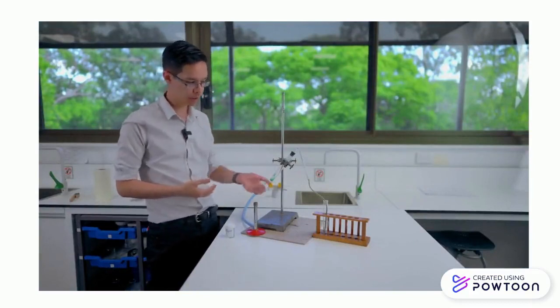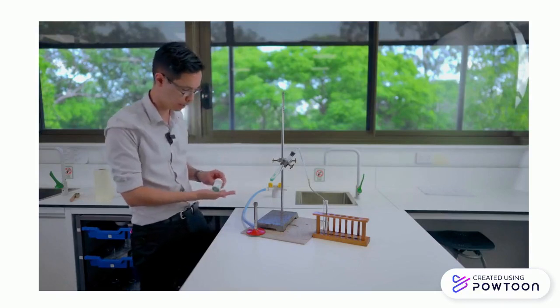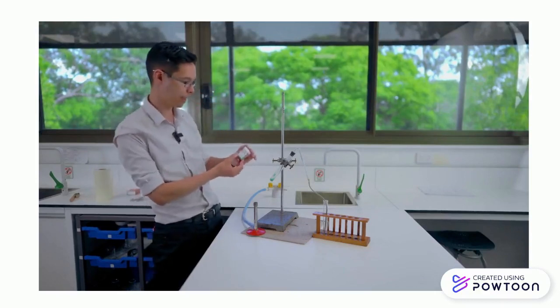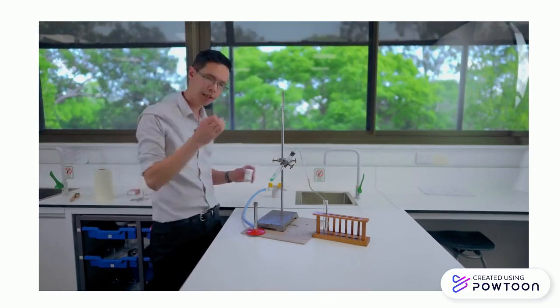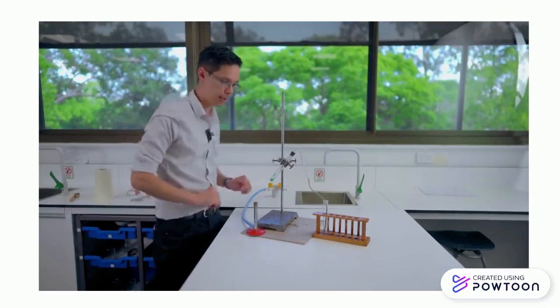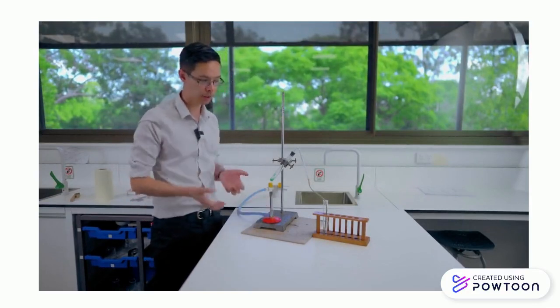This one here, we've got a starting substance called copper carbonate. That gives it this beautiful green color. It also seems to be mixed with a little bit of perhaps a hydrated part of its compound here, so we've got it also mixed with a little bit of copper hydroxide. Let's just call it copper carbonate for now. And I've already added some to the test tube here, and we're going to heat it up, and we should start to see a chemical reaction occurring.